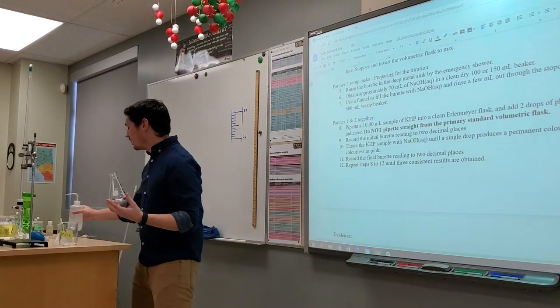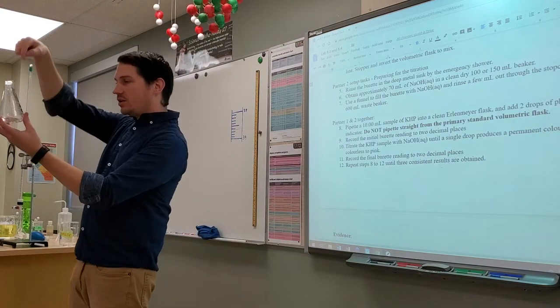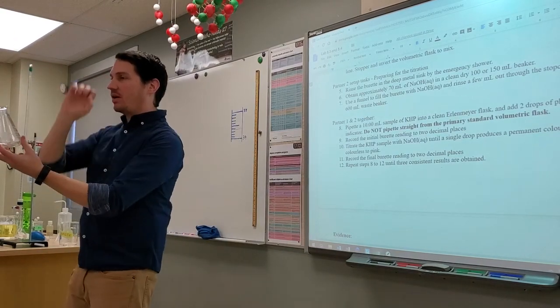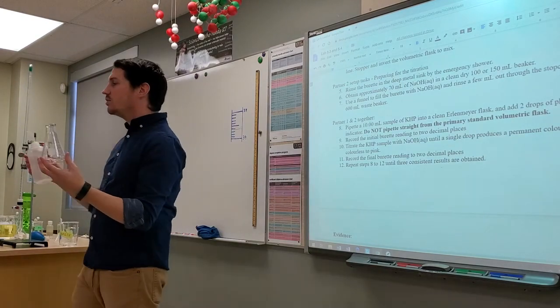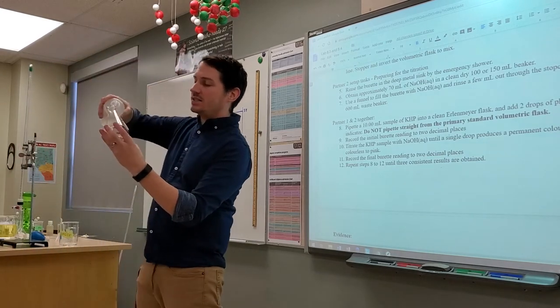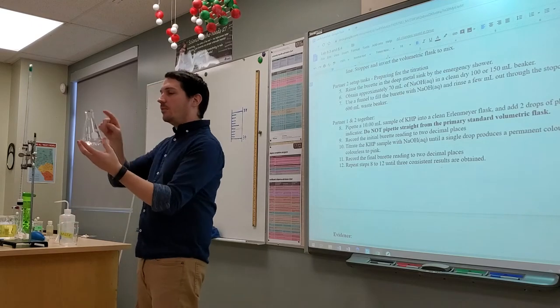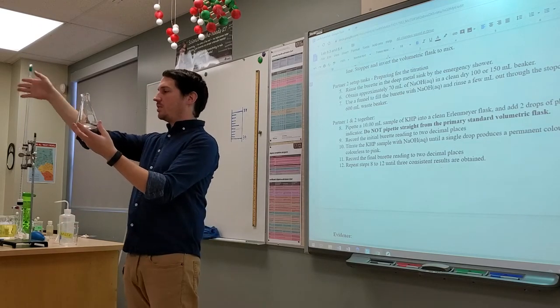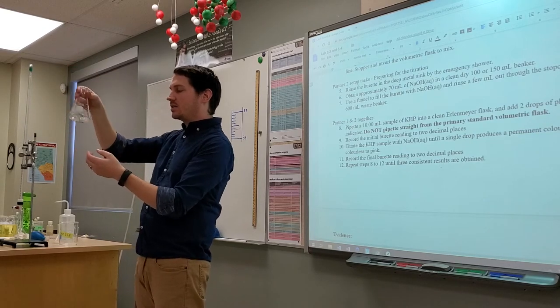And that's really important because as you add your titrant to this, it's going to drop and splash up onto the sides of the container. Periodically, when you get close to your end point, the color change of your titration, you want to take the molecules of KHP that have splashed onto the sides of the container and rinse them back down into the bottom here.